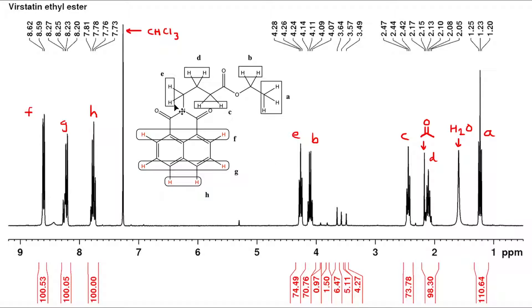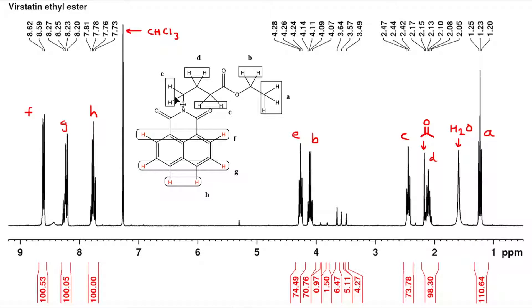The protons labeled E are next to a nitrogen and two carbonyls, creating a large deshielding effect, so we expect them more downfield. They also have two neighbors, so the E signal should be a triplet. The signal around 4.24 ppm is indeed a triplet, and its chemical shift matches the chemical environment of the E protons.